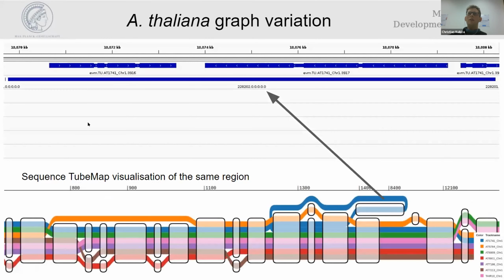Next session, it's the very same. So we have our annotation. That's the ortholog of the gene that we are looking at. That's another gene that has been annotated, probably the transposable element gene. And once again, we see it's in the bubble with the very same feature here, that it's a repeated left and right anchor. That's probably a remnant of the insertion event of this gene that has been dragged along by the jumping transposable element.